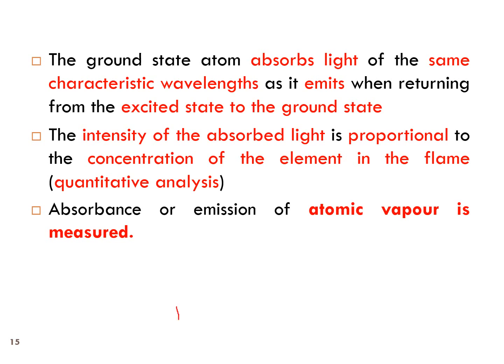Okay, contohnya ni adalah flame. Dalam flame ni akan berlaku excitation of your atom due to the high temperature of this flame lah. So bila dia excited dia akan go back to its ground state lah, akan jadi atom balik. So at that time lah the radiation from the source akan go towards this flame, then this ground state atom will absorb the radiation from this source.